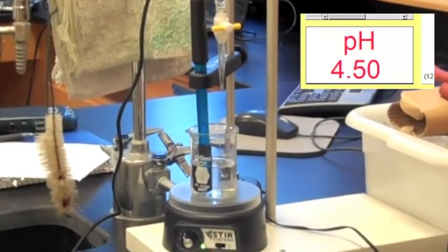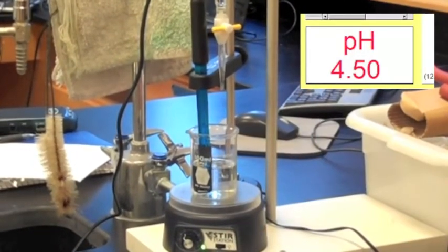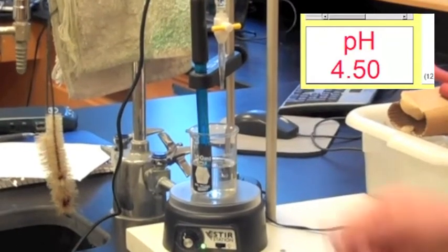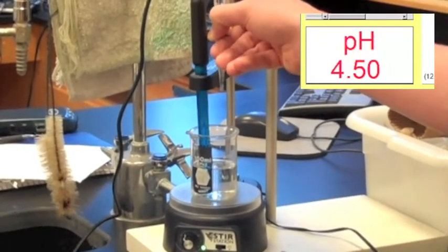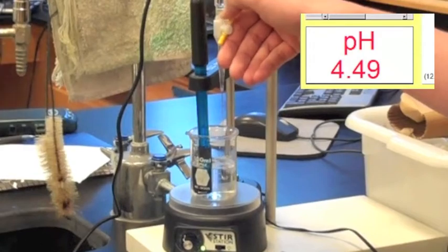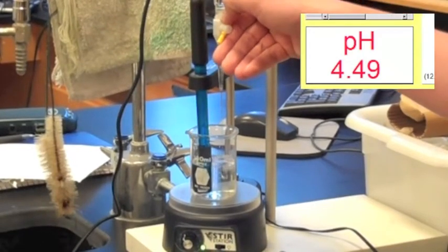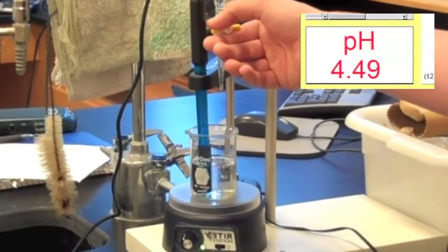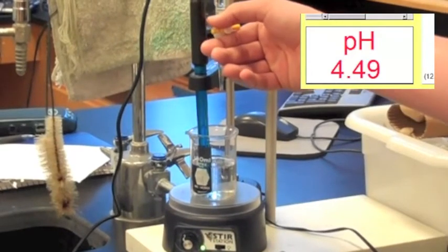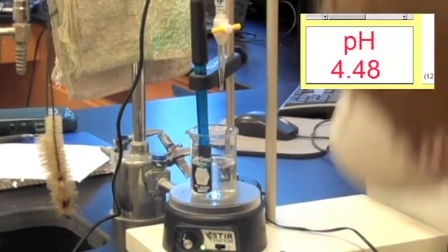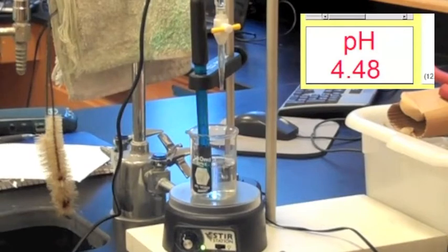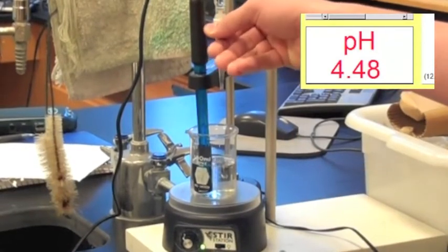Now I'll add another 10 milliliters or so. The pH has dropped about 0.01, 0.02, but the acid hasn't really had any great effect.